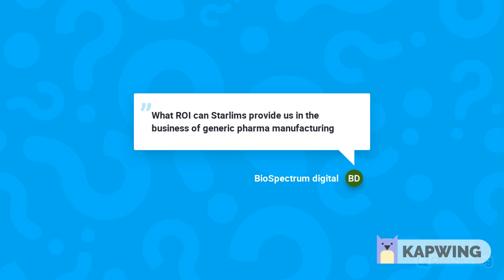If we're talking about an end user in the laboratory, usually that should not take any longer than a day, and different businesses want to do it in a different way. In general, StarLIMS takes a train the trainer approach, which means we will train your training staff in the specific areas of the system tailored to your business that they will need to train in. In other cases where businesses don't have trainers, sometimes we've done that training for them. So it's on a case by case basis.